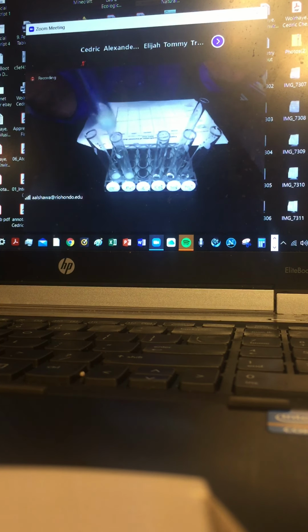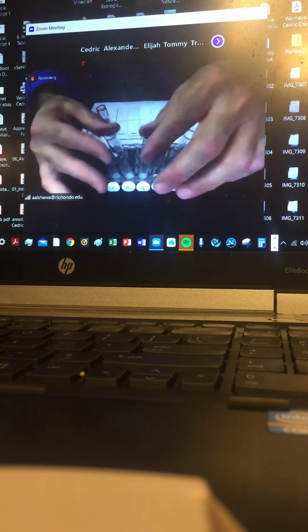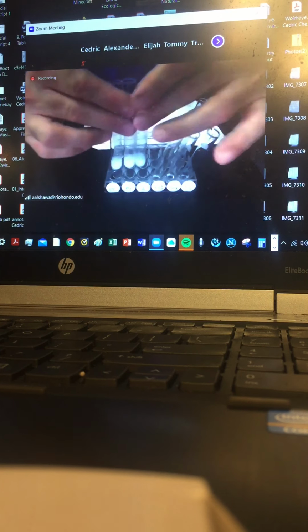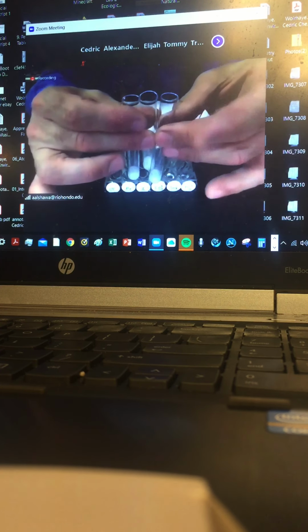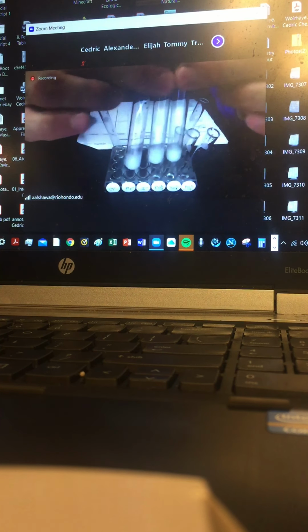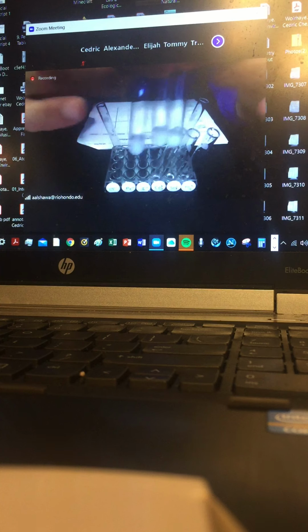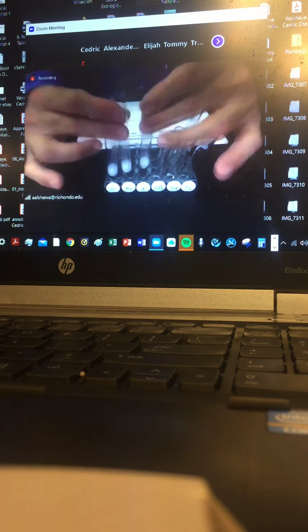Okay, so noting all these are pretty much similar. So if you notice, here's the outcome of the 3 halides. So this is the chloride, the middle is bromide, the one on the right hand side is the iodide. So that's the result. Okay, so just make sure to write down the result as you see.